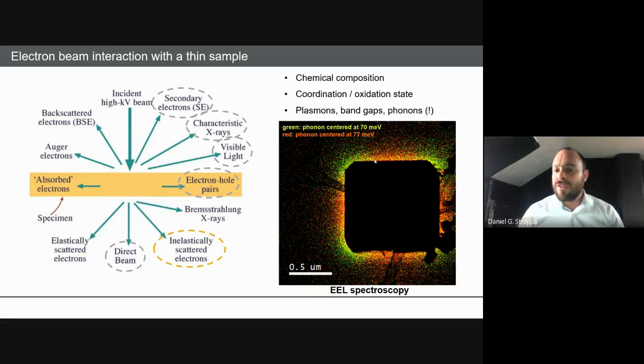And then how it works is that we have at the bottom an energy loss spectrometer. So it's basically a device that is going to capture the electrons after they go through the sample, and is going to sort the electrons in terms of the energy. And then you can have this function. You count electrons by the energy that they lose, and you can retrieve this kind of information.